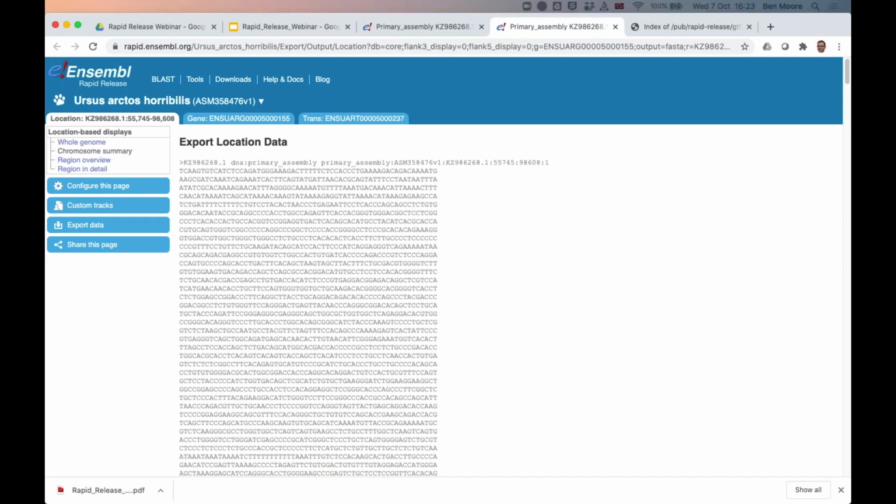There's one comment. I think I might have misspoken. I think I might have said transcription, but you're exactly right. The translation start site is the ATG. In the example that we were using, there were no untranslated regions upstream of the ATG. So you're exactly right.